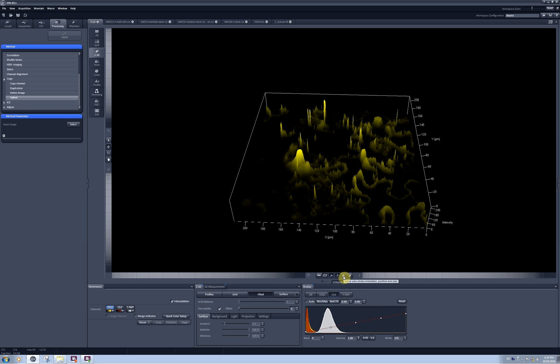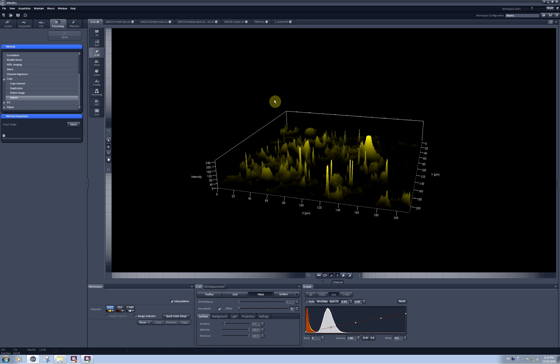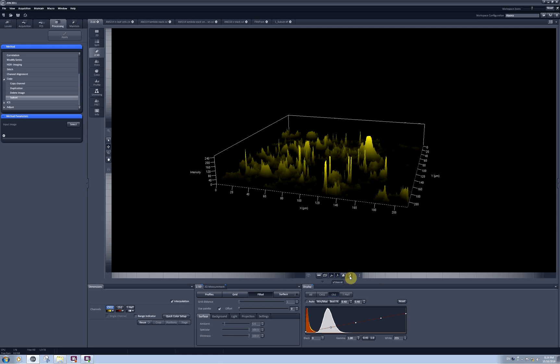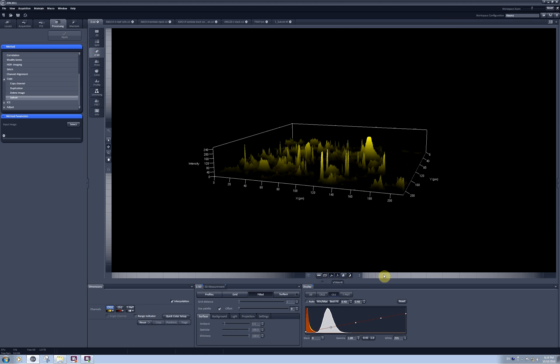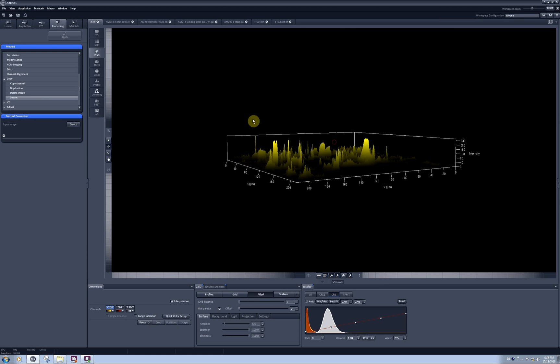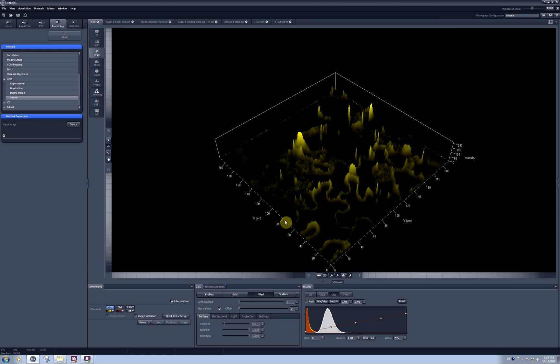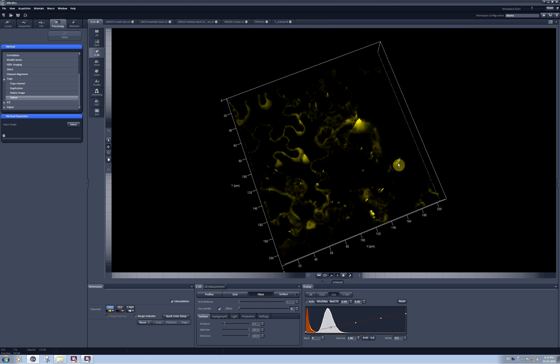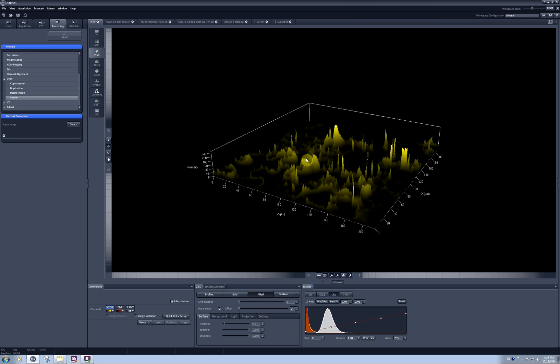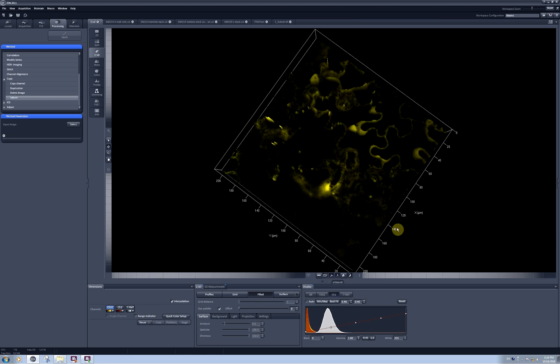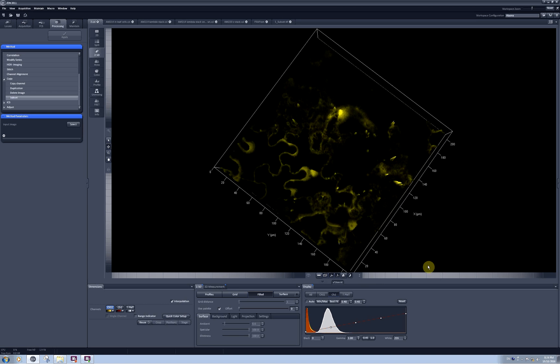The home button brings the whole model, the reconstruction, to the original position. And this button allows you to activate the spin mode. When you click on it and drag your model, you will send it into spin.